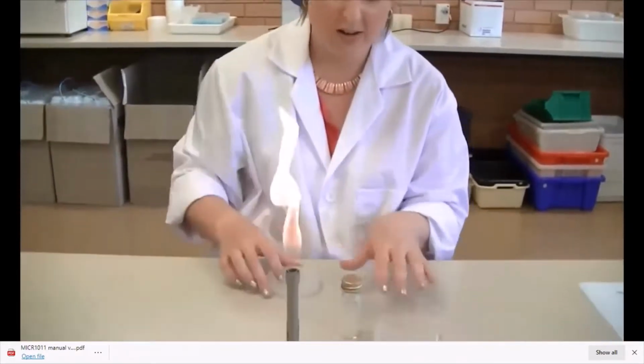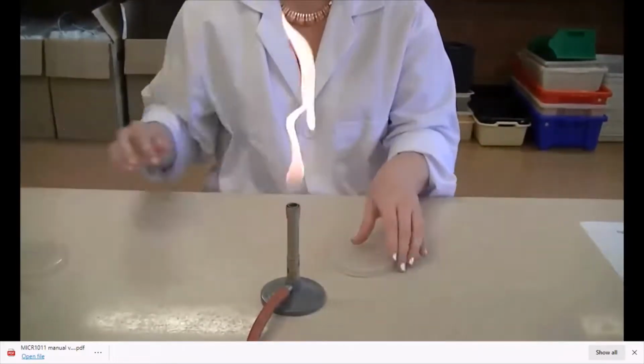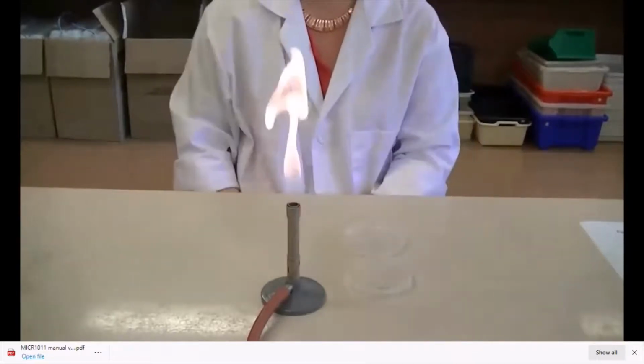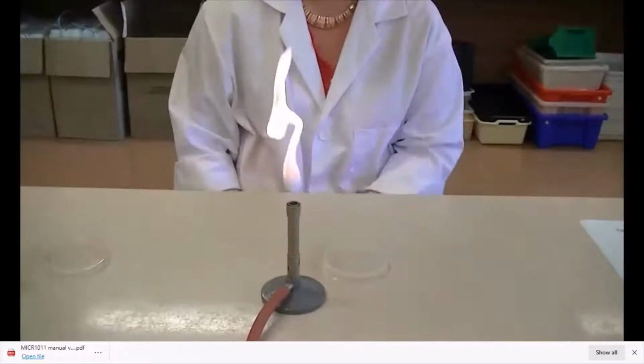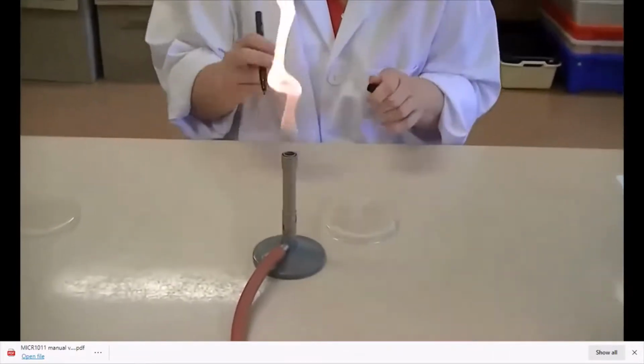The technique that I'm going to demonstrate is the streak plate technique. This involves transferring an organism, whether it be from a solid medium or from a broth culture, onto another solid medium. In this example, I'm going to use nutrient agar, and I'm transferring the organism E. coli. One of the first things you need to do when performing the streak plate technique is to label your plate. You should have a permanent marker on your bench, and you need to label your plate with some key information.